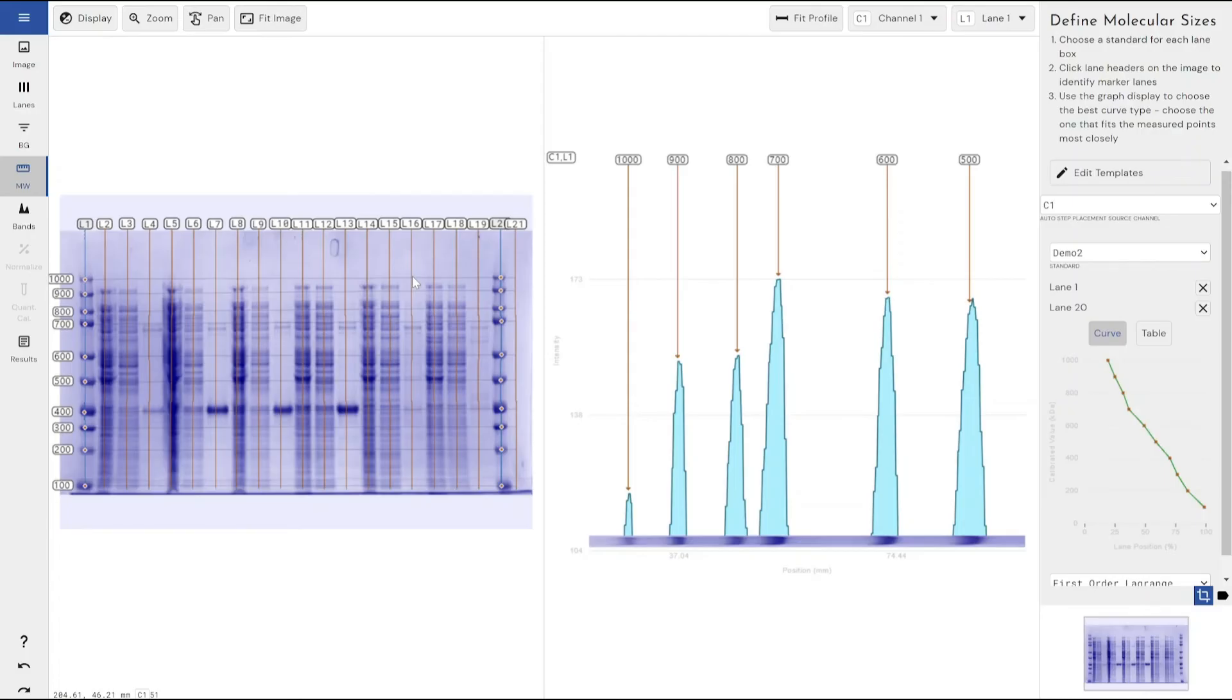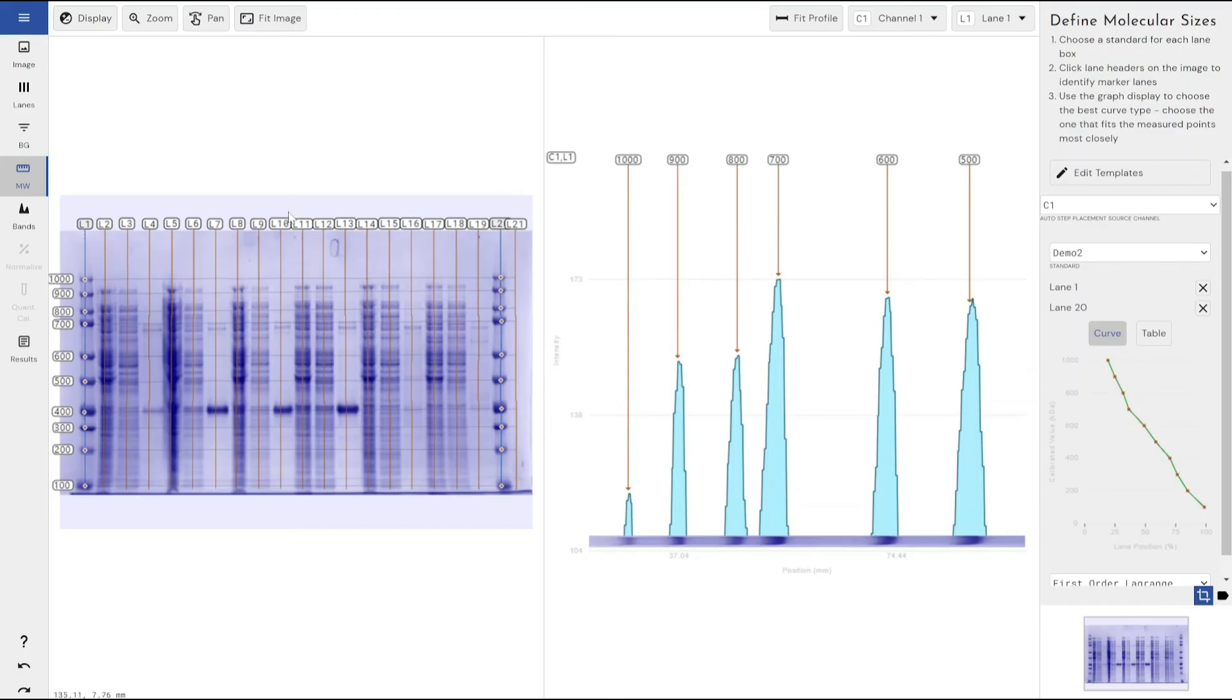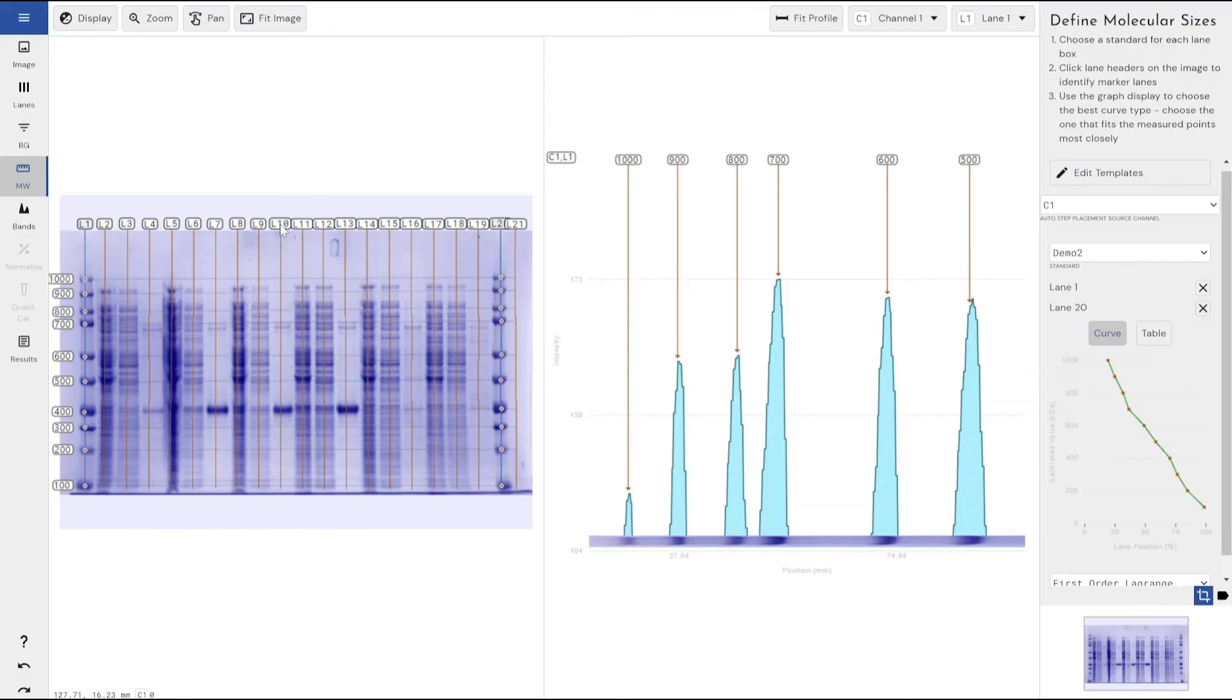The benefit of having multiple molecular weight marker lanes within the same image, within the same gel, is that the software will use both of these points, if you've got two, or if you've got three, you can drop another one in the middle. It will join up those points and accommodate mathematically for any curve that's occurred within your gel.